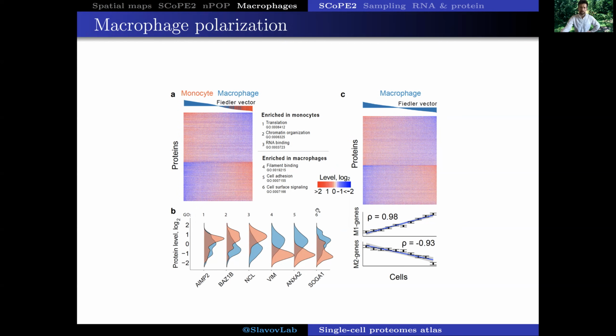The more interesting observation is that if we look just within the macrophages, we still see a gradient of heterogeneity, and this gradient is something that we did not know to begin with in the experiment. We had a more or less clonal population of monocytic cell line, differentiated in an environment that was as homogeneous as we could make it, without polarizing cytokine, and nonetheless we see that heterogeneity emerging, and we wanted to explore what might underlie it.